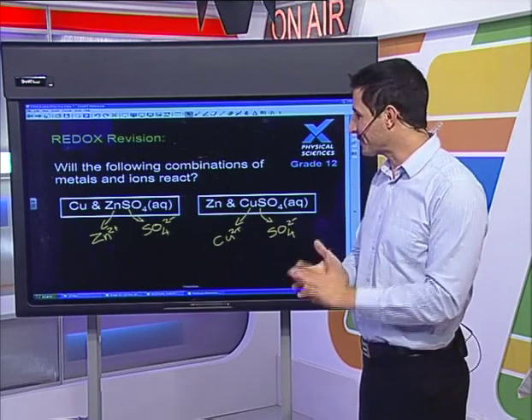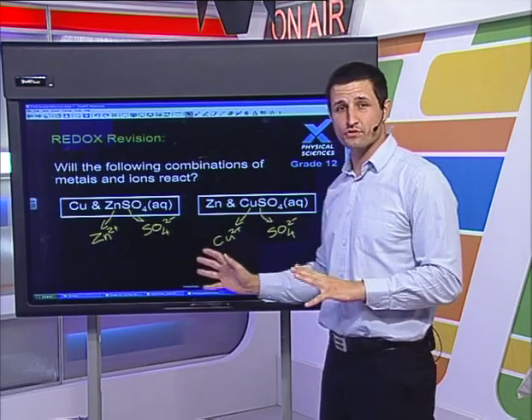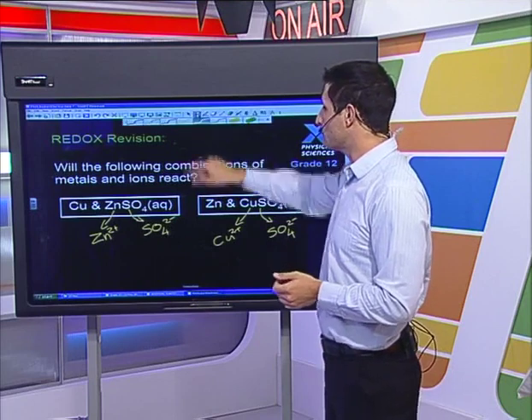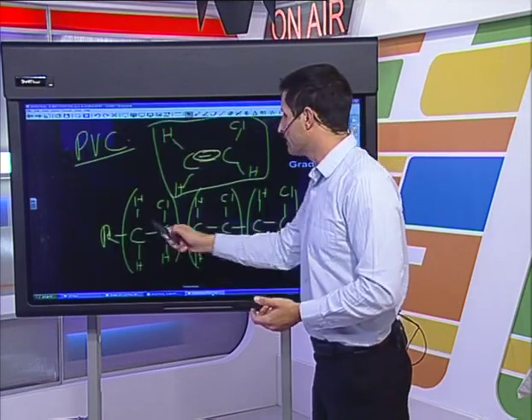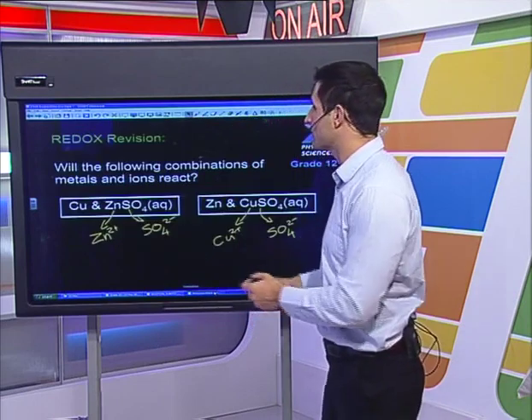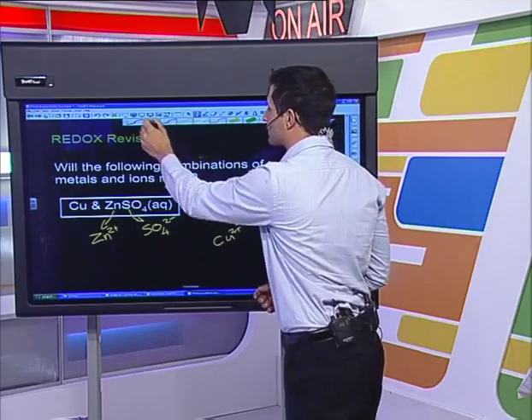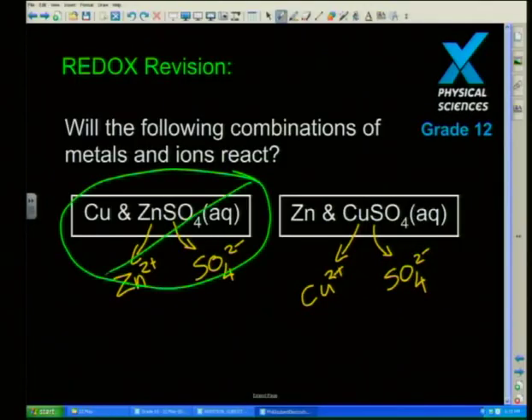Okay, all right. So now what I wanted to bring some attention to was that one of these reactions happened and one of them didn't. I noticed initially when I took some copper and placed some zinc sulfate inside there, let's just bring that back, zinc sulfate and copper, there was no reaction. I'm going to cross this out to show that there was absolutely no reaction. The brown stayed brown. Absolutely nothing happened at all.